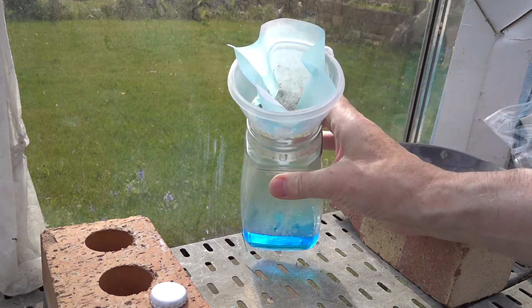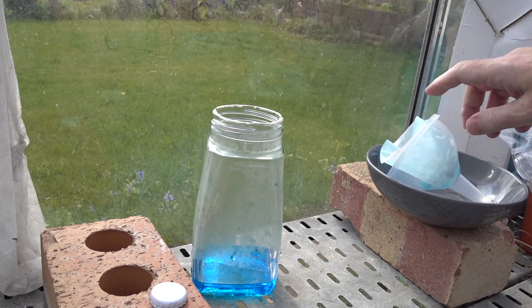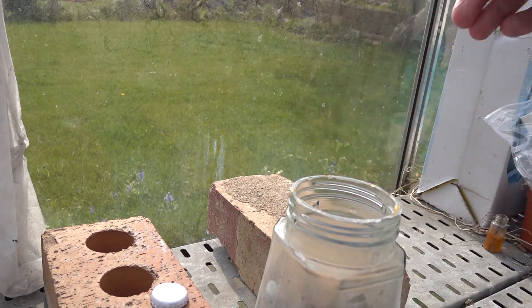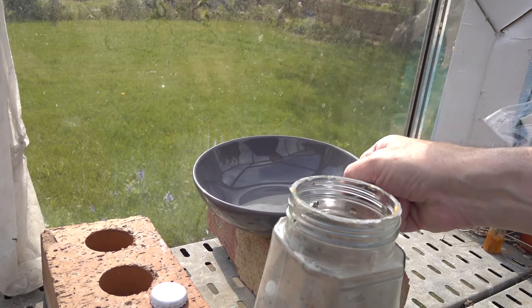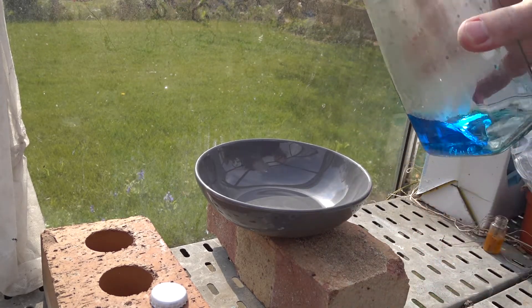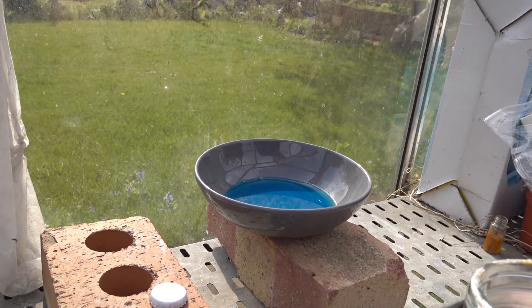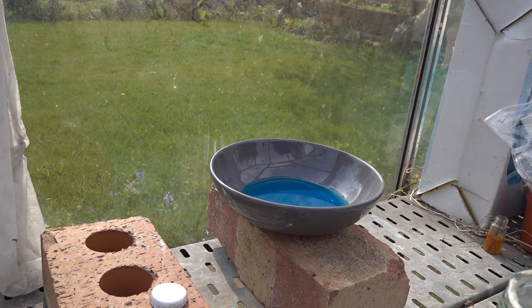Here we've got our copper sulfate which has finished filtering. We now need to move on to the evaporation stage. So let's remove the bowl used before for dissolving, and we can use a clean bowl to serve as an evaporating basin. What we're going to do is pour the filtrate, which is the copper sulfate solution, into the evaporating basin.